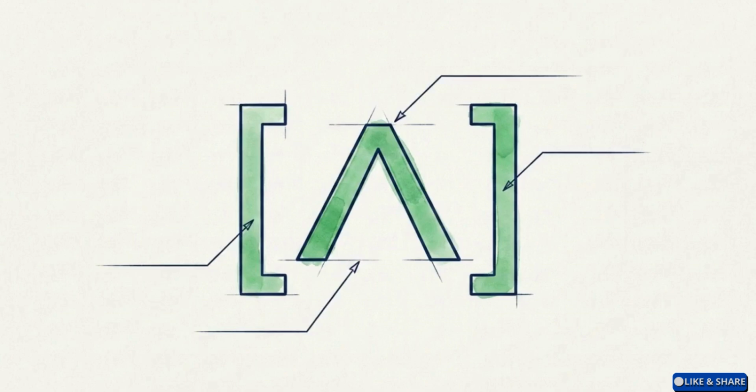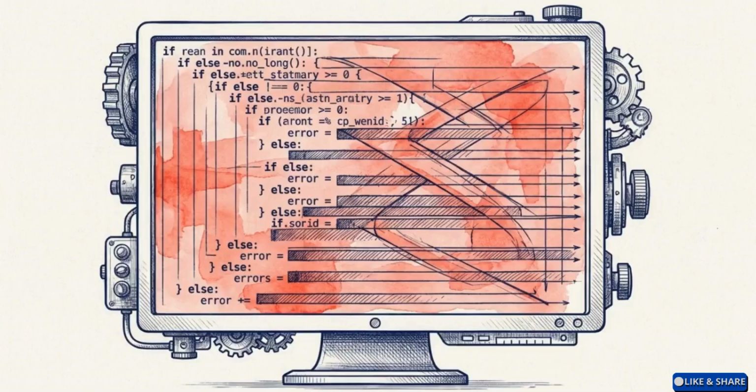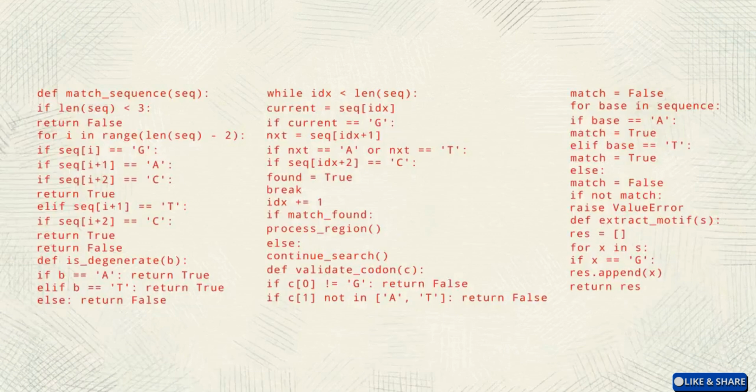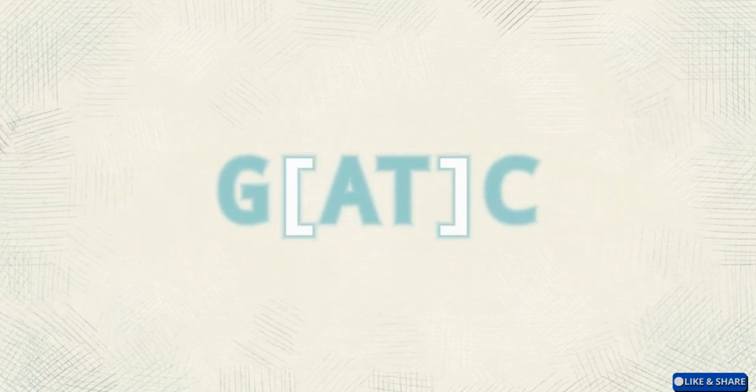You can also simply invert this logic. Placing a caret symbol inside the brackets excludes specific nucleotides. This allows an analyst to bypass documented mutations while capturing all other variations. Instead of writing dozens of brittle if-else statements to account for every possible point mutation, a character class condenses biological degeneracy into a single line of search logic.